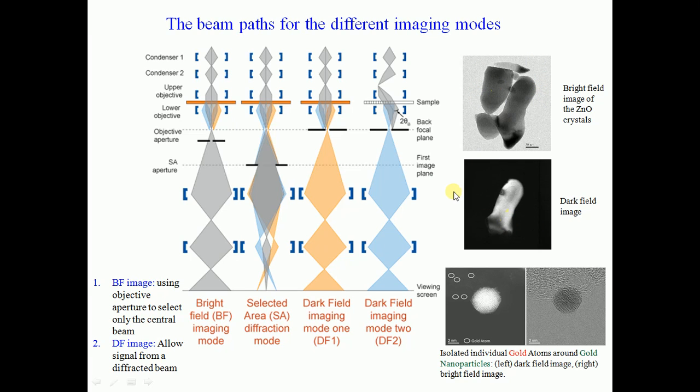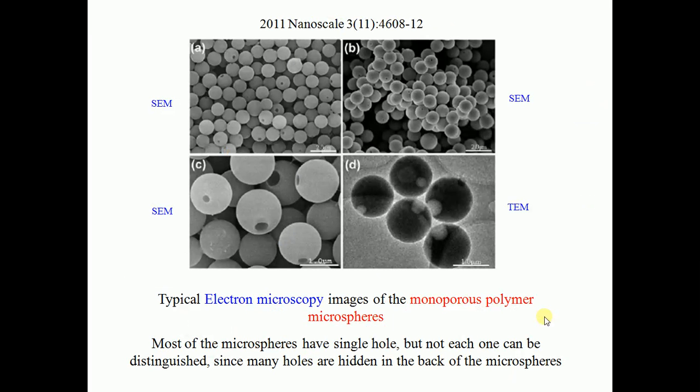And this is the dark field, meaning the background is dark and the image is bright. So you can distinguish between the photographs and images, and you can characterize. These are the TEM images taken in dark field, and this is bright field. You just see the difference between the photographs, and a lot of information is hidden in bright field and dark field images.